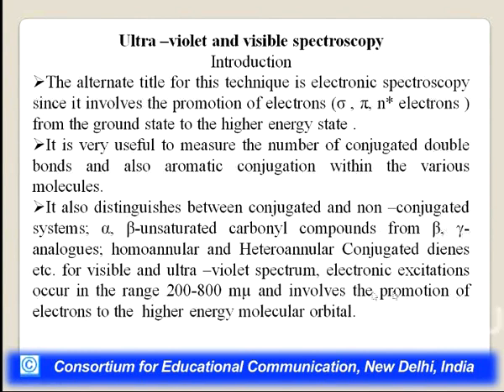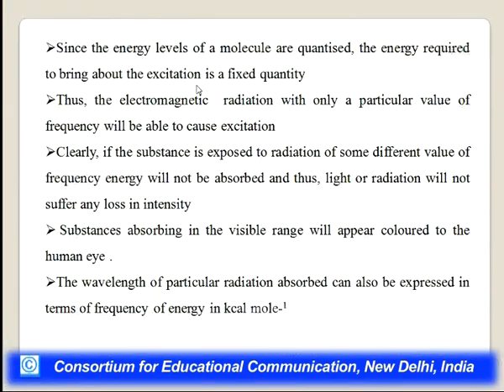You can see the range of electronic excitation, 200 to 800 millimicron, and it involves the promotion of electrons to a higher energy molecular orbital. Since the energy levels of a molecule are quantized, the energy required to bring about excitation is a fixed quantity. Thus, the electromagnetic radiation with only a particular value of frequency will be able to cause excitation.